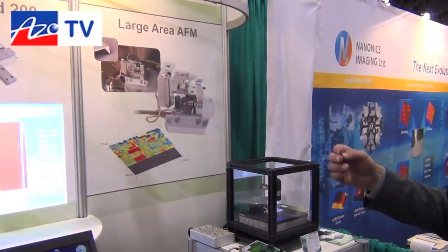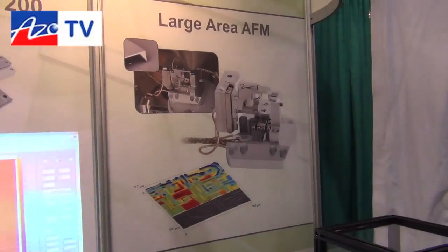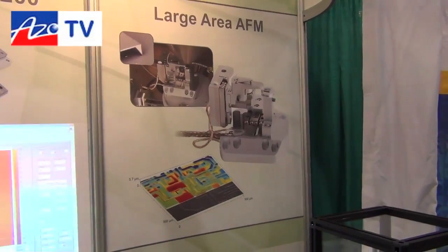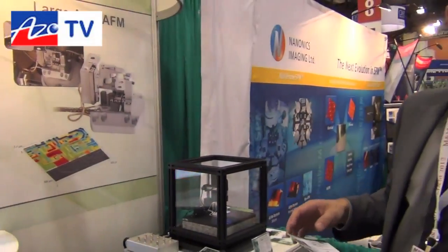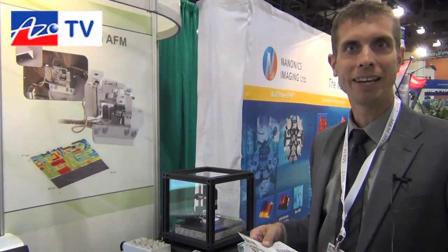What we have here is a quite interesting approach for an AFM. In that picture you can see a manipulator which is based on our standard positioners, and what you don't see is a separate scanner. We do both the coarse positioning and the fine positioning, always in one positioner. That means it's a very compact setup, which is very good for SEM integration — a system that can work in an SEM without taking a lot of space.